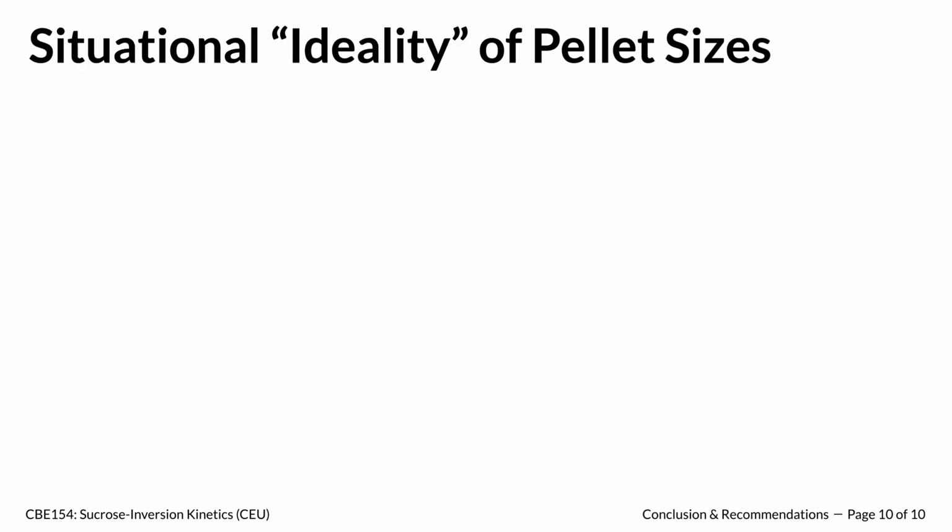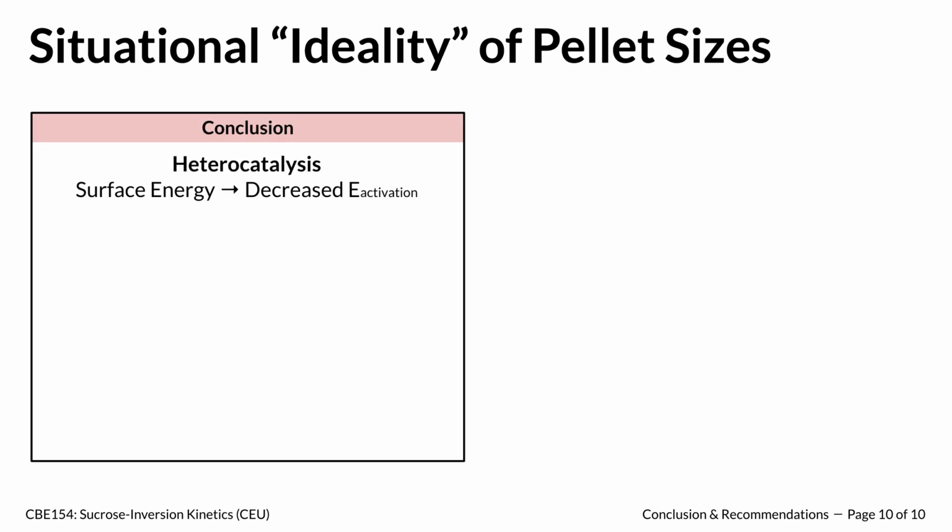After looking at the multiple facets of this laboratory experiment and detailed data analysis, we conclude that designing heterogeneous catalysis requires one to consider a wide variety of factors, not just conversion. Throughout this experiment, we observed that the lowering of a reaction's activation energy is possible using heterogeneous catalysis. Our team also modeled a PBR operating at a specific temperature with a large pellet size and realized that although our model wasn't very sophisticated, we were able to learn the relationship between temperature, diffusion, kinetics, and conversion.